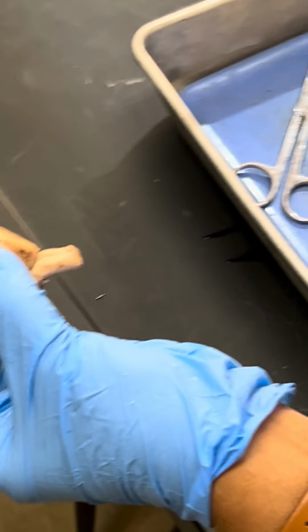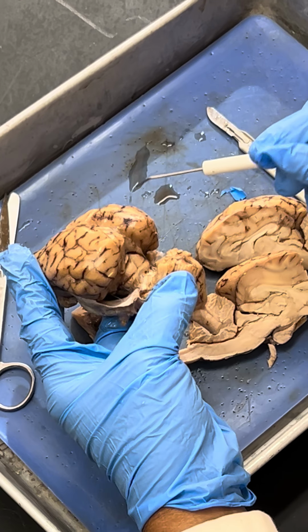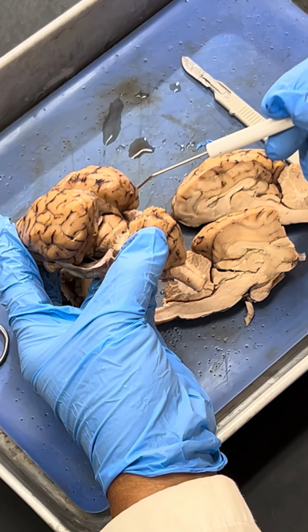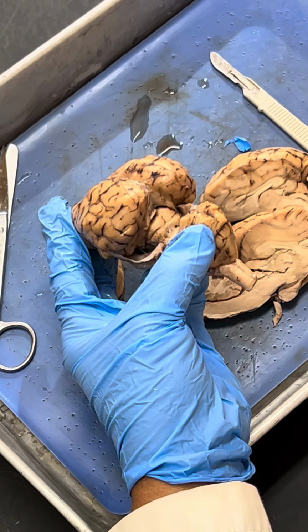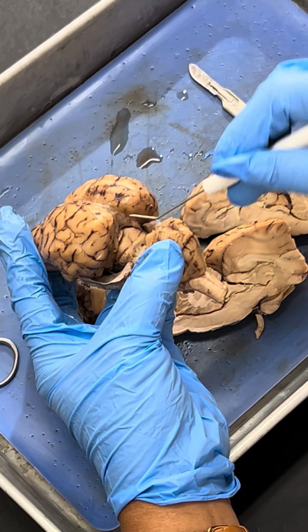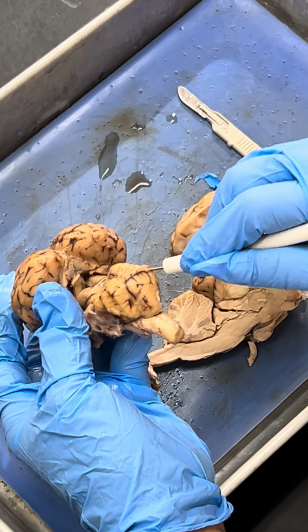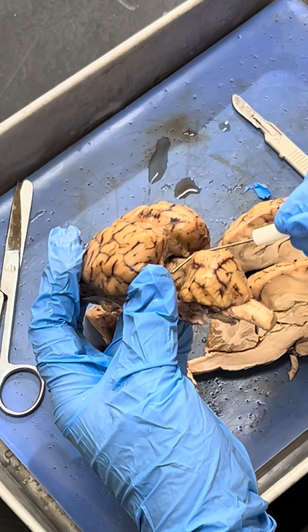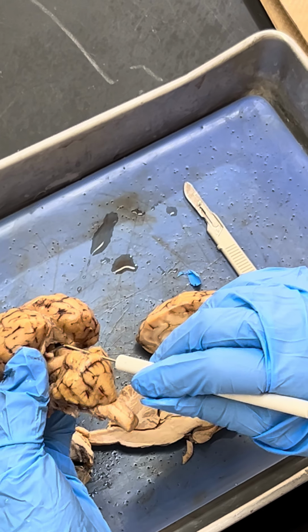These four together is known as tectum or corpora quadrigemina. The upper two are superior, the lower two are the inferior colliculi. If the pointer is here, if you write tectum, that's fine. Or you can write superior, inferior colliculi or corpora quadrigemina, whatever. If you press this, you will see a tongue here. There's a tongue-like structure. If you press it, it's very hard to see now.